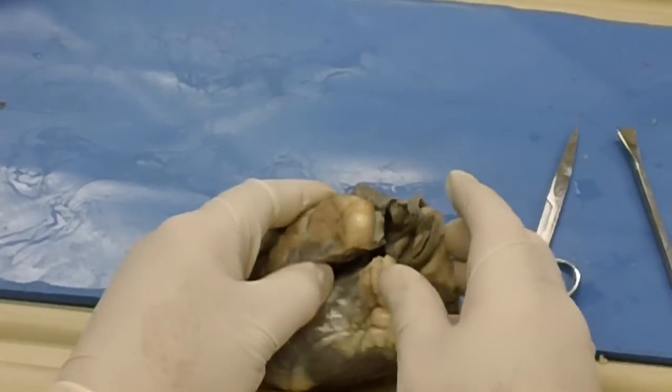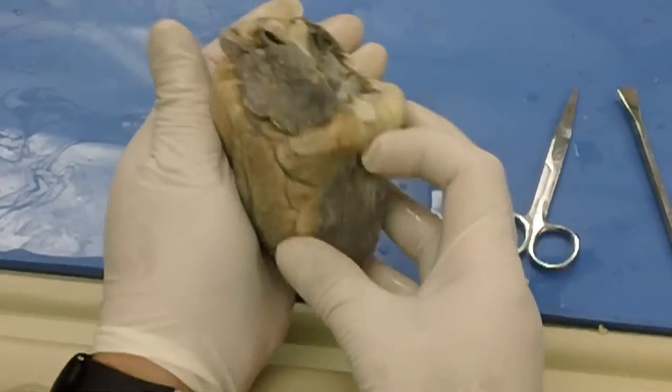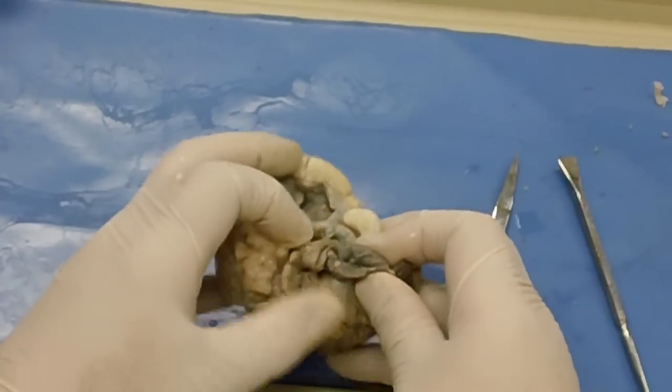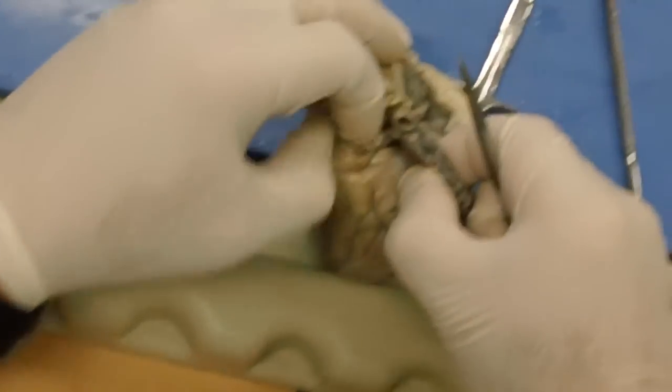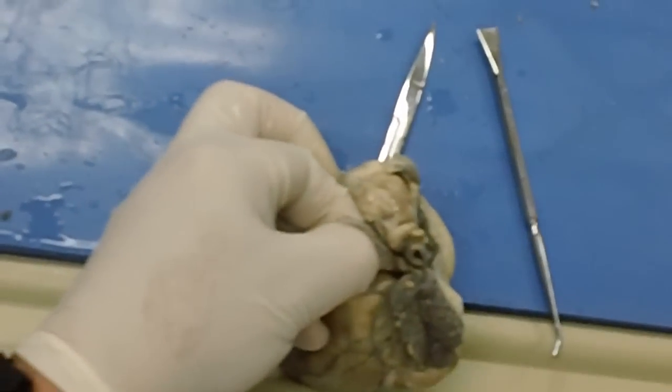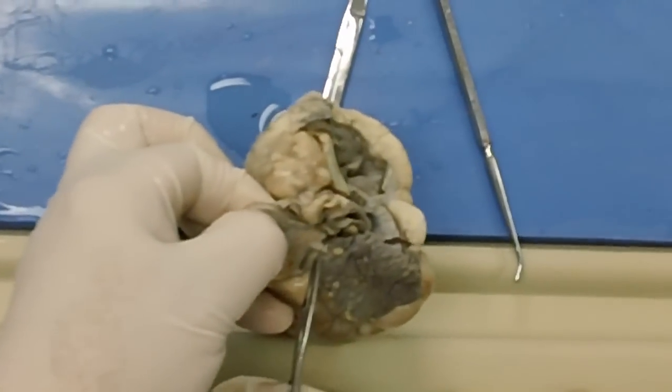So we're down into the left ventricle now, and now to get out the aorta, we're going to have to expose the aorta a little bit here. I'm going to try to get through some of this fat.